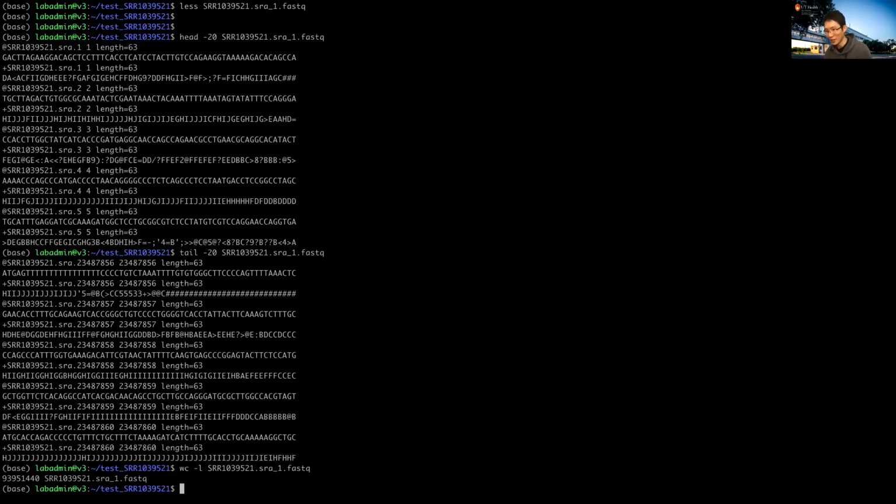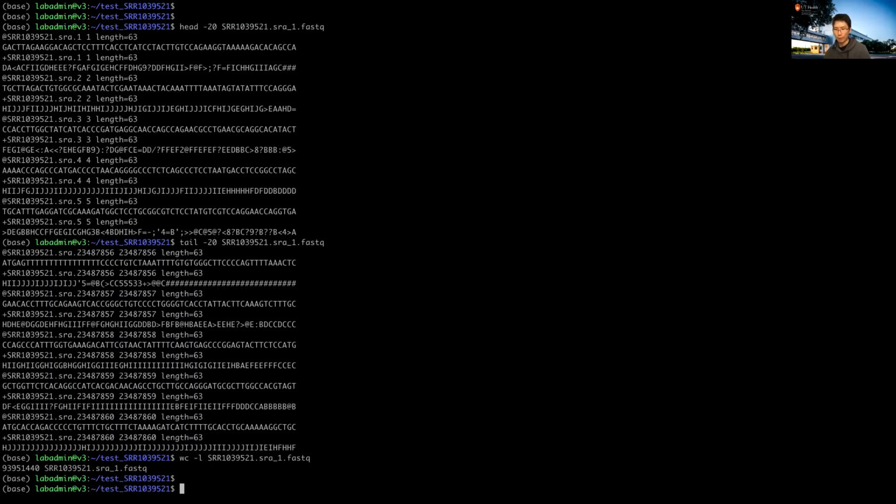Okay, you guys can try wc -l on this file. It tells you, let's see, it's like 94 million lines, but you need to divide it by 4. So it's roughly 20 to 25 million reads in this specific sample. So wc -l gives you the number of lines in this FASTQ file.